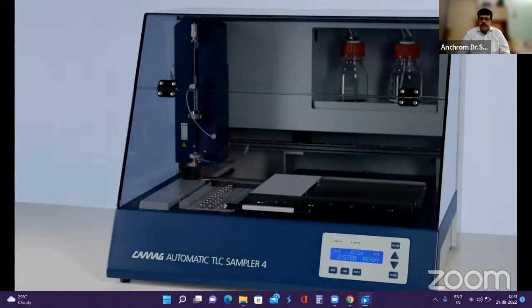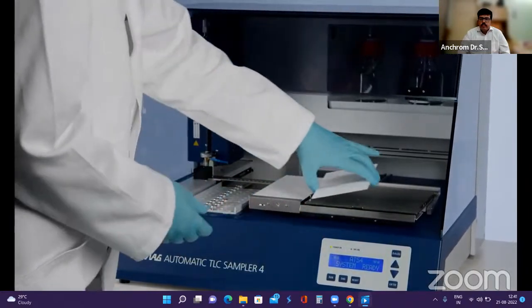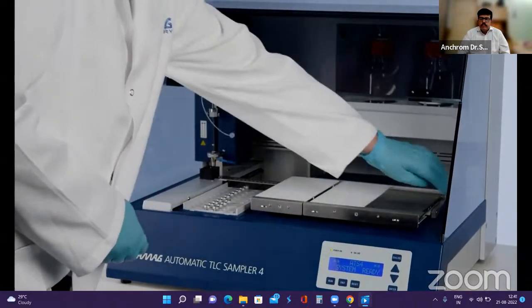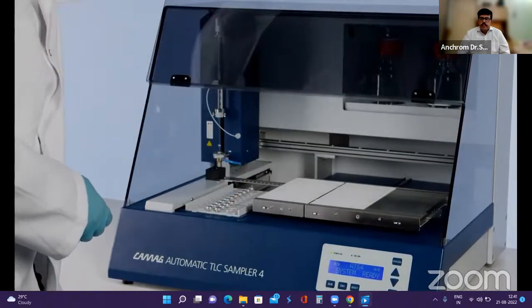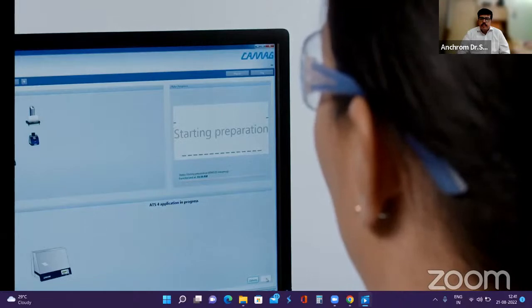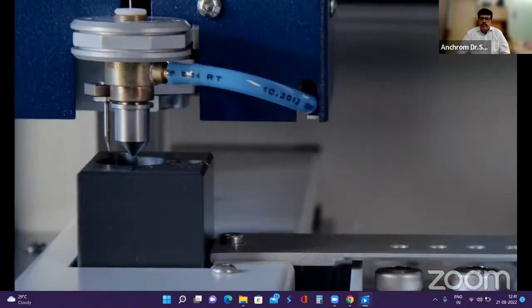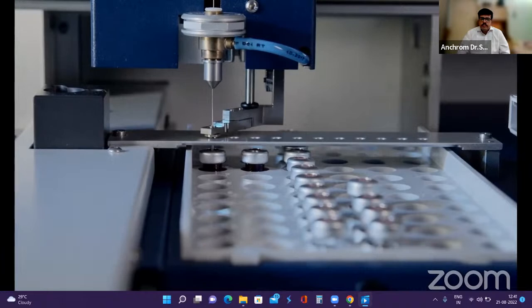With its guided approach, the VisionCats HPTLC software effectively leads you through the entire chromatographic process, step by step. Position the HPTLC plate on the self-adjusting object support. After having loaded the ATS4, you can start the fully automatic sample application. VisionCats displays the current status of the sample application and the expected end time. An application sequence starts by rinsing the syringe. Next, the septum is punched and the needle lowered into the sample vial, thus allowing the syringe to be filled with the sample solution. The septum punch is retracted prior to the needle being removed to ensure the outside of the needle is wiped off by the tightly closing septum.